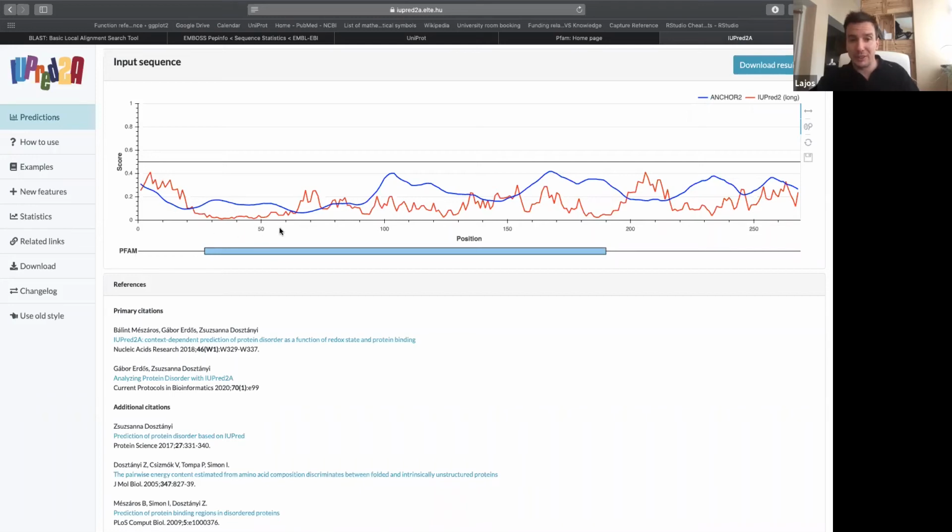And also there is something here that is a bit strange as well. So we have about 20, 30 amino acids that seem very hydrophobic. We will see much more hydrophobic proteins today. But even this one, if you see something like this, is there anyone who has an idea what a 20, 30 amino acid long, very hydrophobic region means? It's usually very, very well defined in size as well. So 20, 25, 30 amino acids in length and extremely hydrophobic. If there is no idea, this is actually inserted in the membrane. Sorry? Inserted in a membrane.